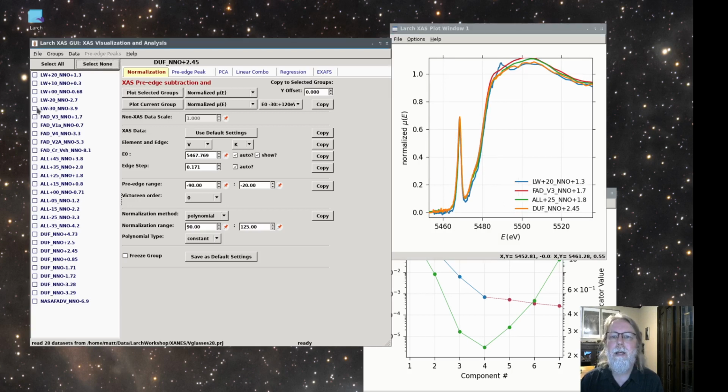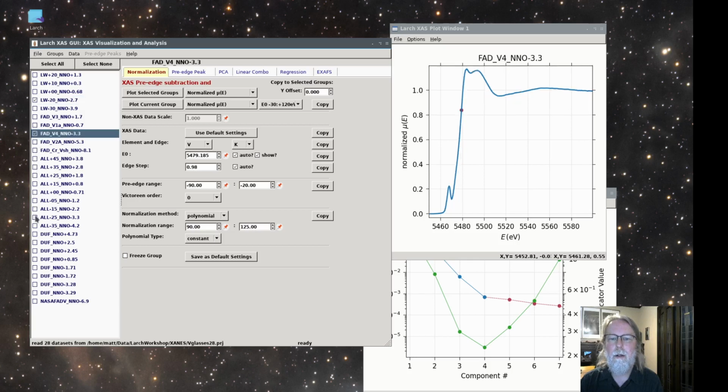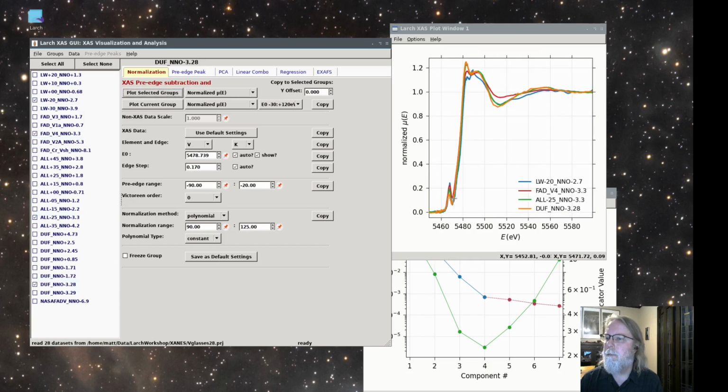And if we do the same, we say perhaps the ones that are close to -3, yes, there's a -3 and a -3 here, this one, and then these are also all pretty similar and much lower oxidation, but there's still some differences between them. So one of the things we might want to do is to encode this number and see if we can extract that from the set of data.